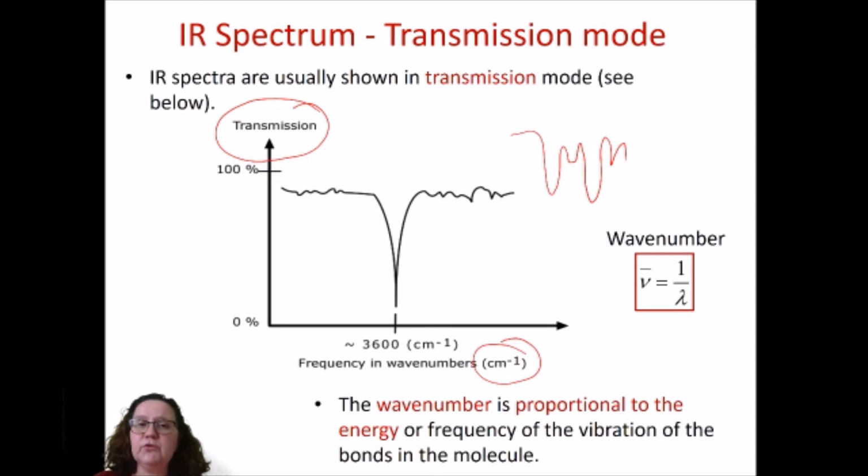The absorption mode tends to sometimes be common in forensics, but in a typical chemistry journal, in a typical chemistry book, you will see all the spectra with the bands pointing downwards. Because it's a transmission, the spectrometer has been run in transmission mode.